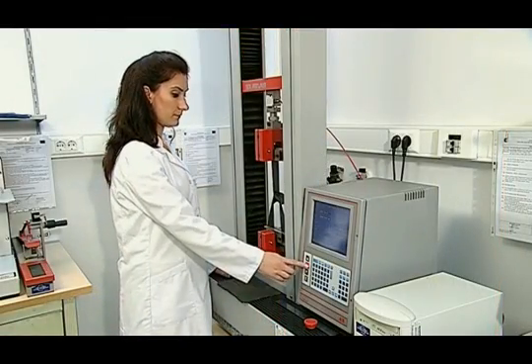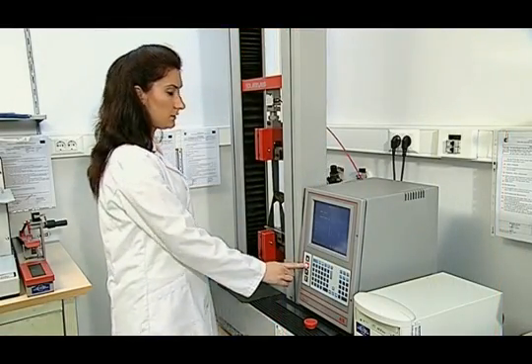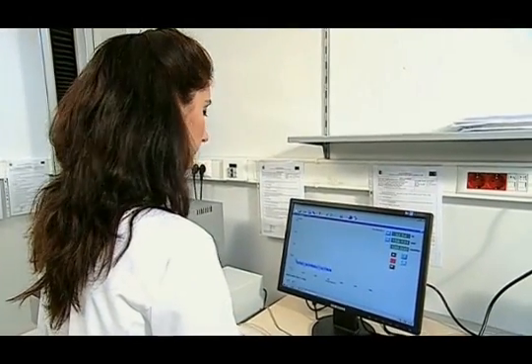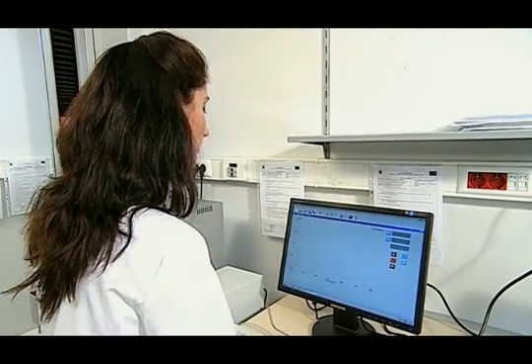Reaching the marked section, the test is stopped, and the result is recorded. Likewise, taking five pieces of weft and five pieces of warp, the test sample is examined. The average of these five values is given as the result of the test.